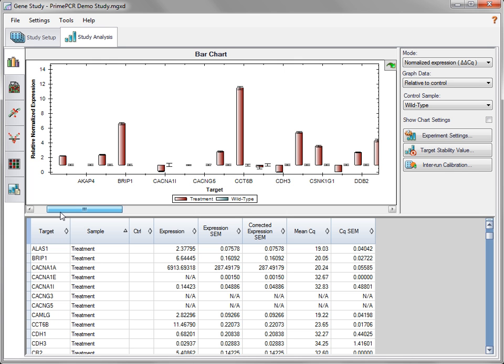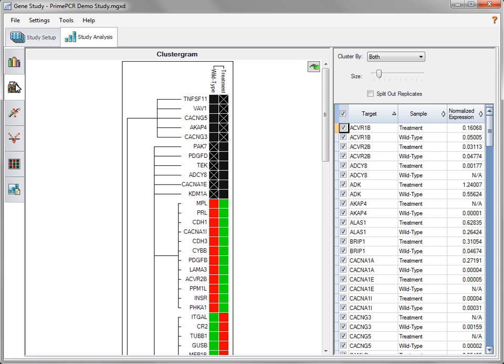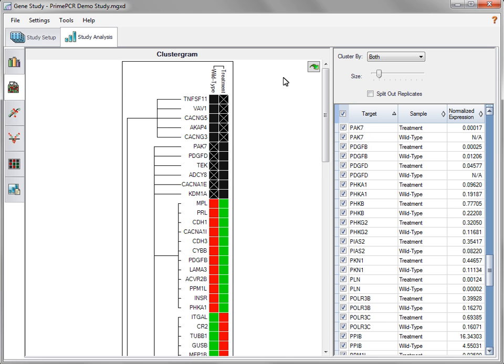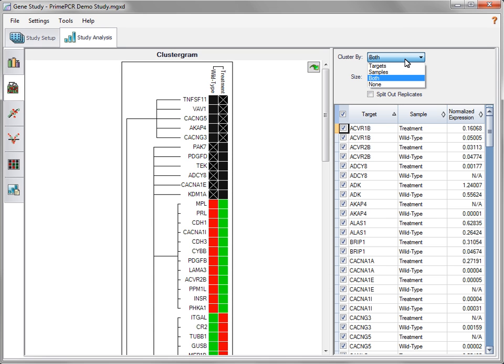In addition to the bar chart, there are four additional types of data analysis available in the Study Analysis tab: clustergram, scatterplot, volcano plot, and heatmap. The clustergram combines a color-coded heatmap with a dendrogram, a tree diagram that depicts hierarchical clustering. Samples and targets that have similar levels of expression are grouped together. Data can be clustered by both target and sample, by one of those alone, or by none.